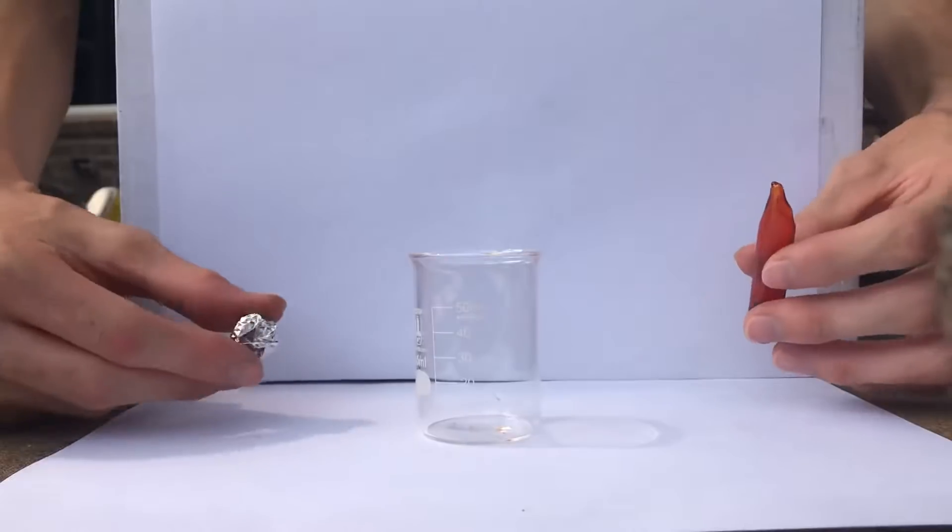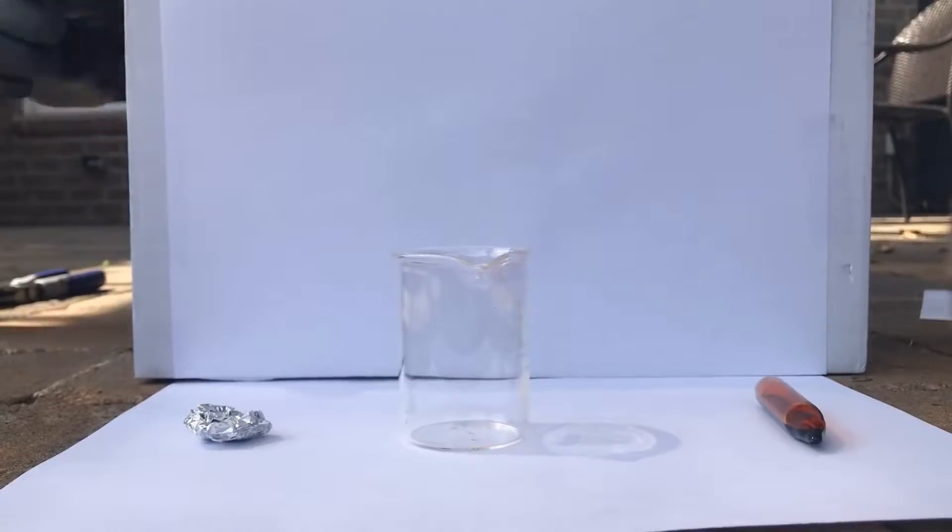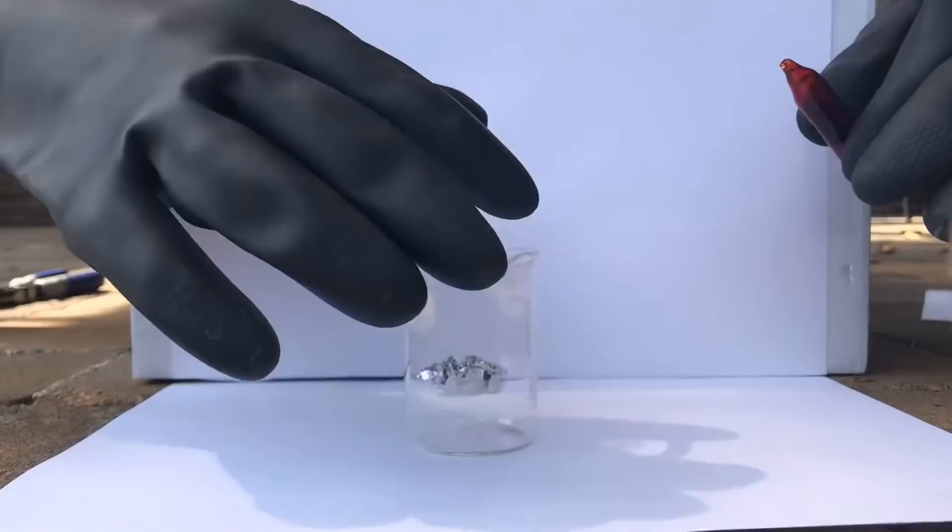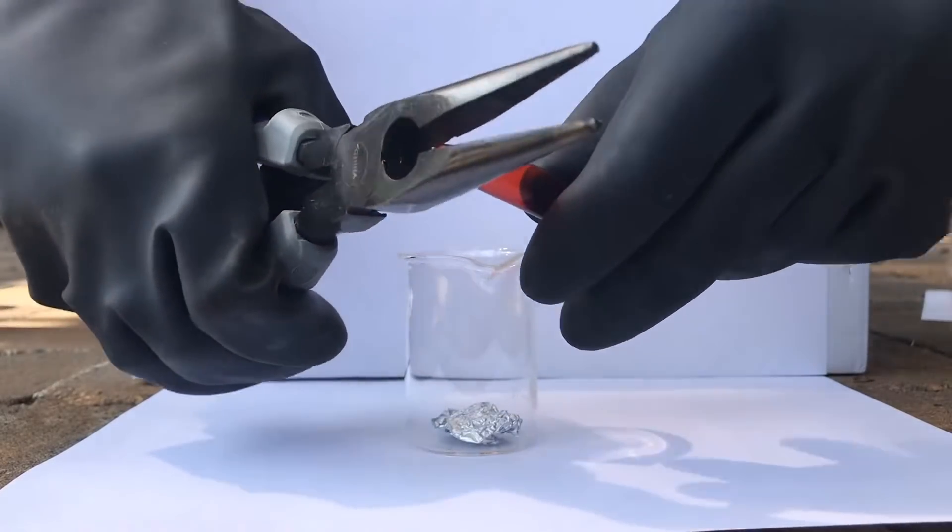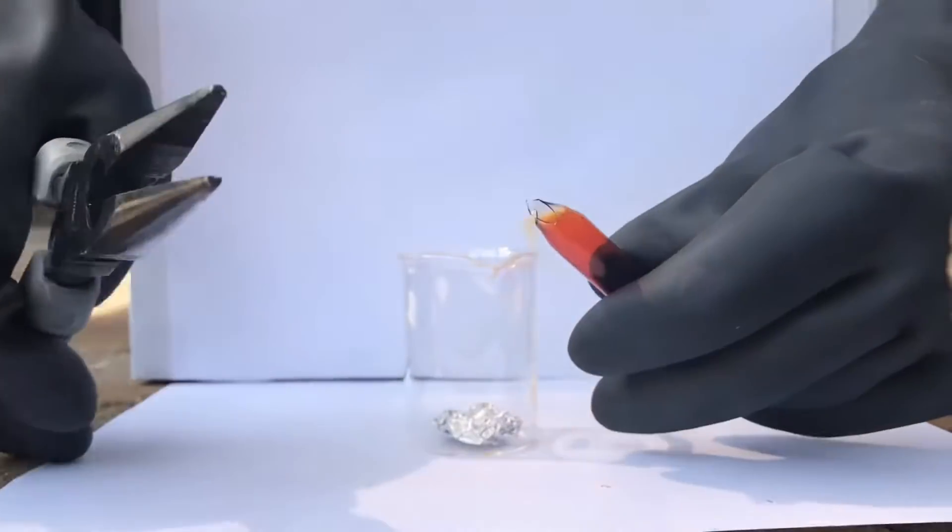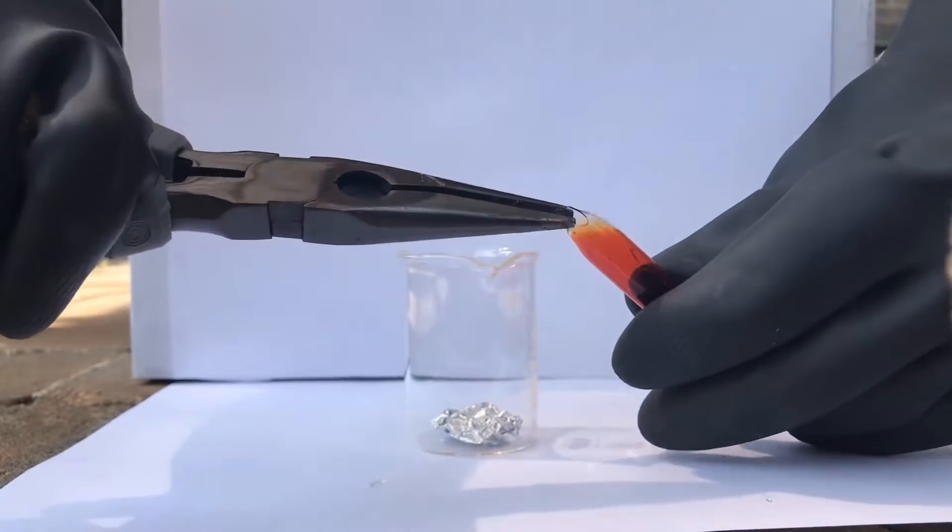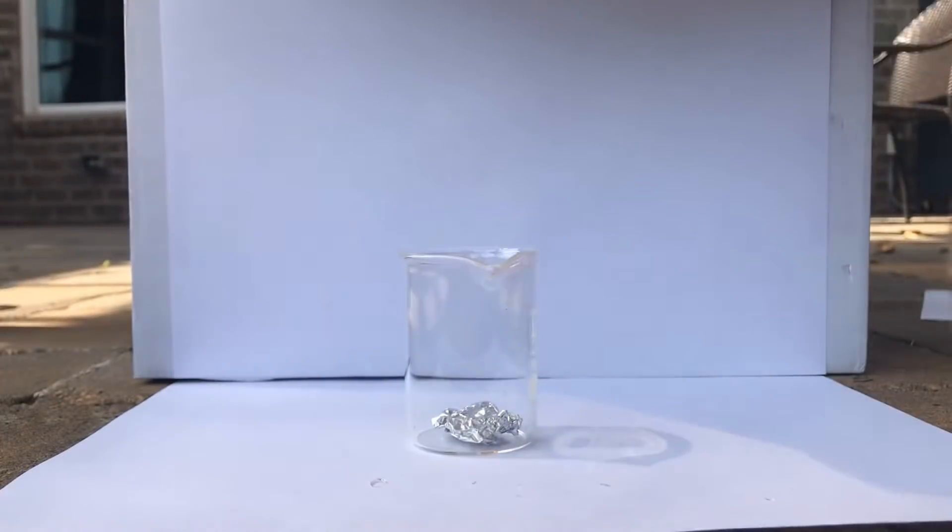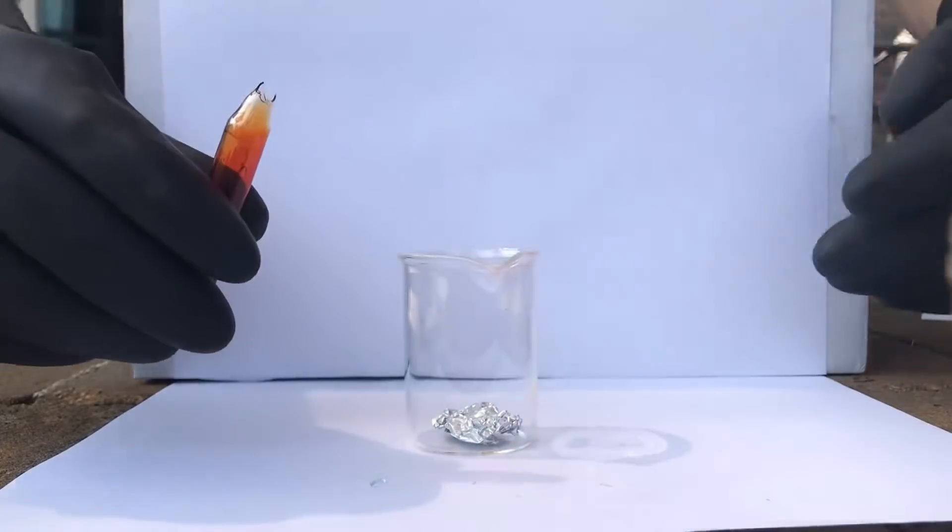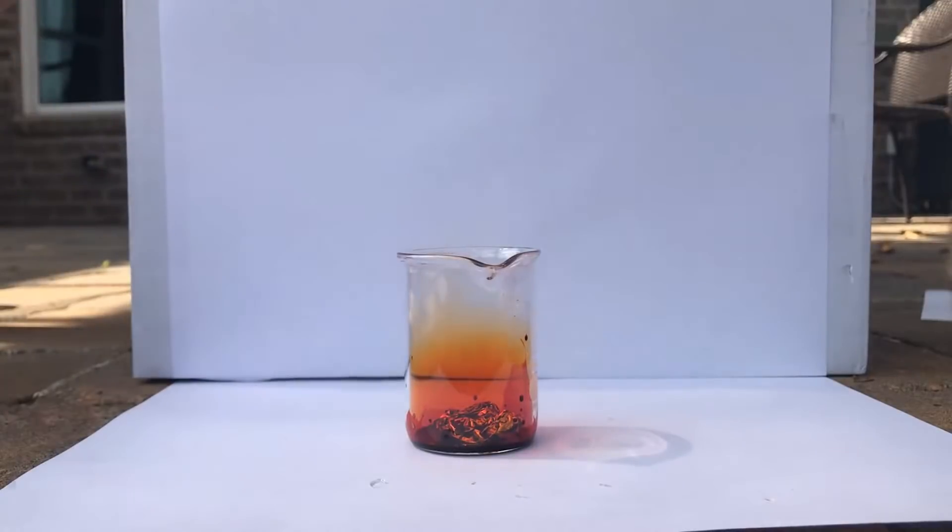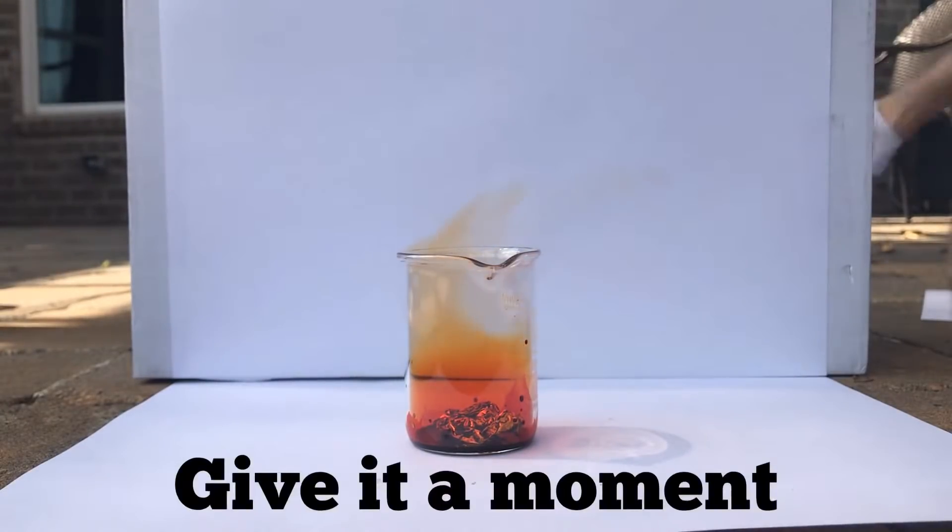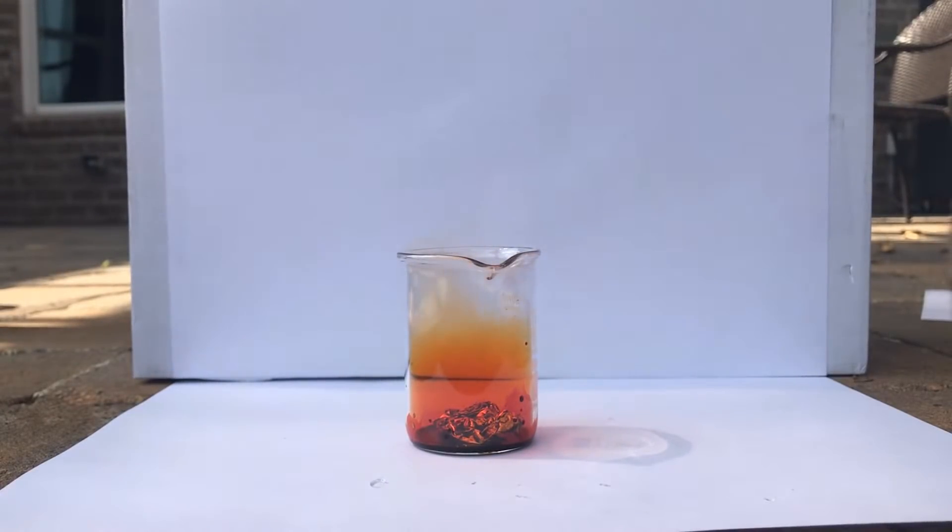Okay, so now we're going to react aluminum foil with bromine. Okay, so in goes the aluminum, let it go. Now to break the bromine. Perfect. Ready? Three, two, one. Back away. I'm not kidding. This is going to be very dangerous.